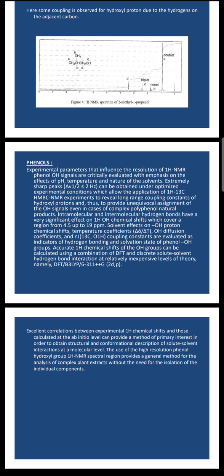Phenol. Experimental parameters influence the resolution of 1H NMR. Phenol OH signals are critically evaluated with emphasis on the effect of pH, temperature and nature of the solvent.